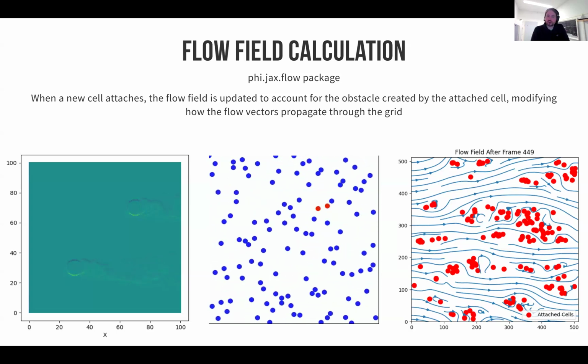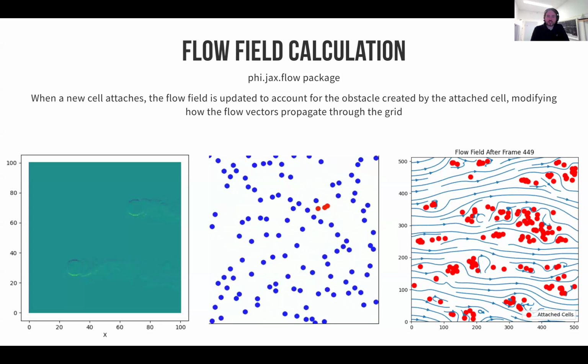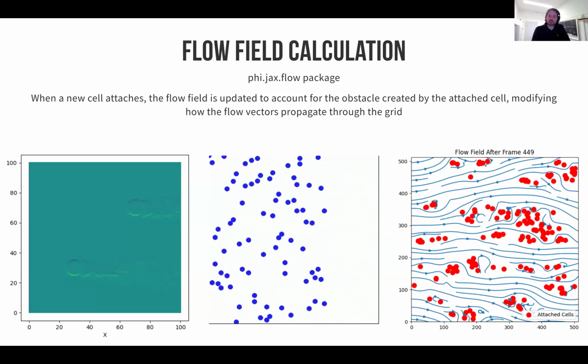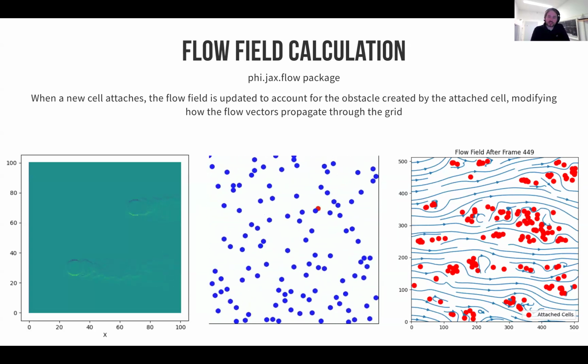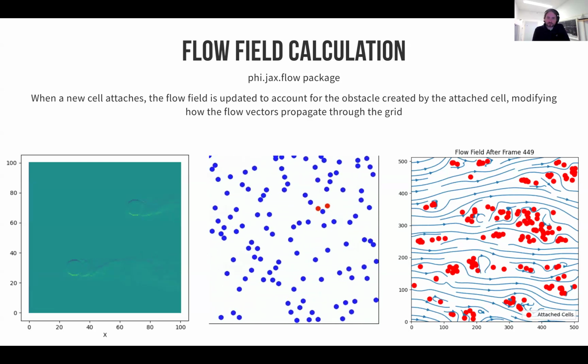And this triggers a very high degree of clustering in silico. So we think that altogether, what matters is not only the presence of a specific receptor on the endothelial cells, but also local flow fields will be contributing to the attachment of the cancer cell on top of the endothelial cells, at least in this kind of experiment.